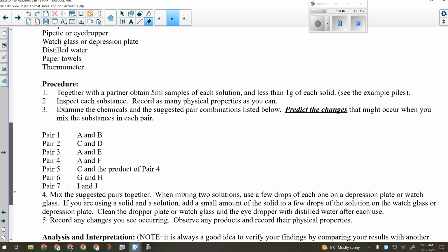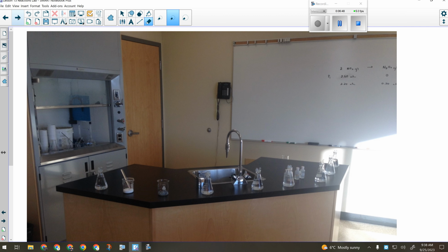And maybe, if we look at this picture, we might be able to determine exactly how that's going to happen. All of the solutions have eyedroppers in them. All the eyedroppers are the same size, which means anytime you mix two of those together, you'll be using the same amount because you'll use the same device to dispense the materials. And we need two controlled, right? You need three.